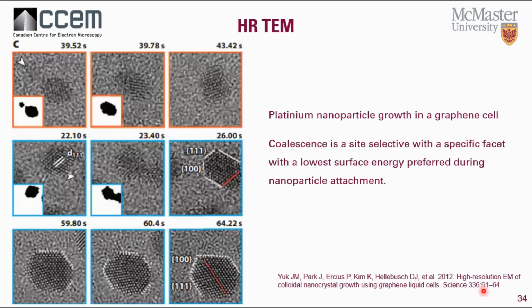High resolution TEM can also be done in really thin liquids using, again, graphene liquid cell. Uke study platinum nanoparticles growth with superior resolution. They found that coalescence is site selective, with a specific facet with the lowest surface energy preferred during nanoparticle attachment.